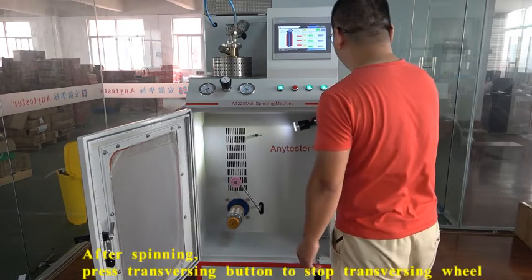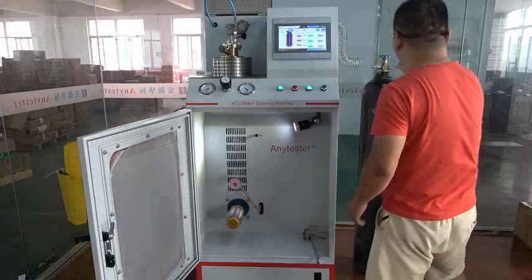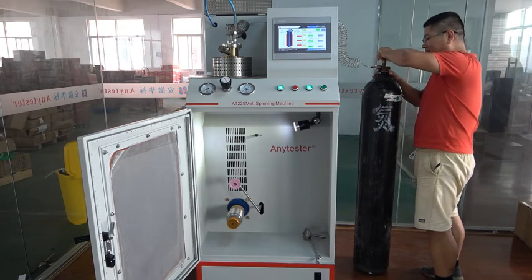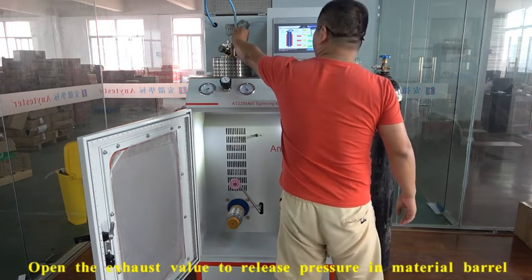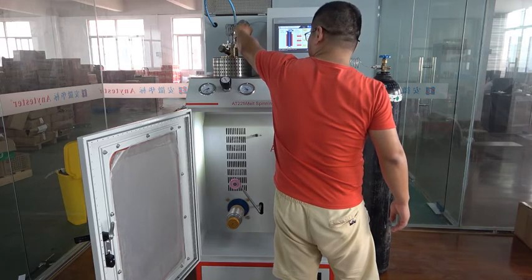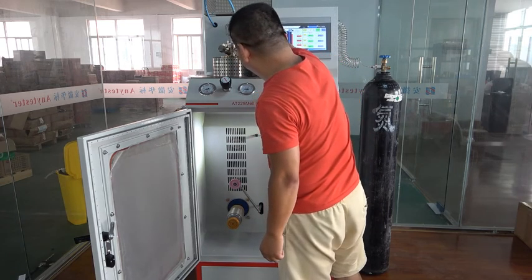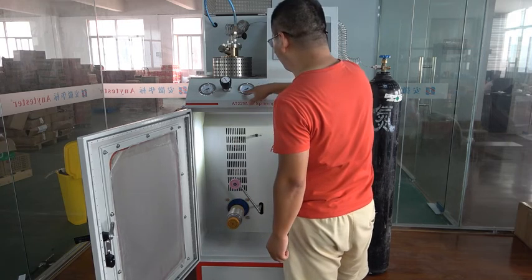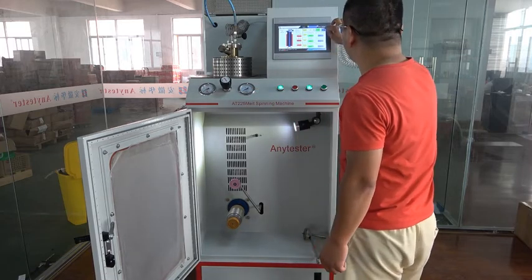After spinning, press this button to stop the traversing. You can also close the traversing valve. Open the exhaust valve. When the pressure drops, stop the winding mode.